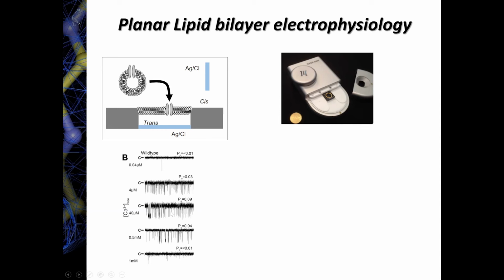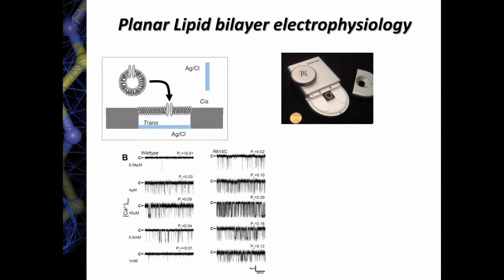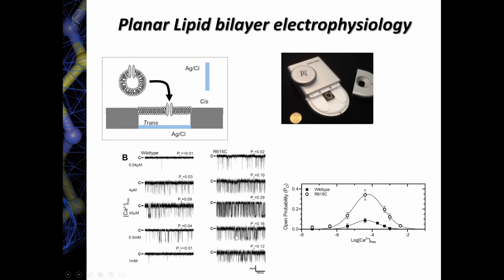Now the precise numbers don't matter here. What really matters is when you compare wild type and disease mutant. So on the right, you see the similar conditions used for the R615C, so that disease mutant big RyR1. You can see that at every calcium concentration tested, clearly the open probability is substantially higher. And so you can also plot this, and you can see here the trace for the wild type in black, and the mutant clearly has increased opening. So this is a typical gain of function mutation, which is entirely what was described before and expected for either malignant hyperthermia or porcine stress syndrome. Okay, so that's the characterization initially.